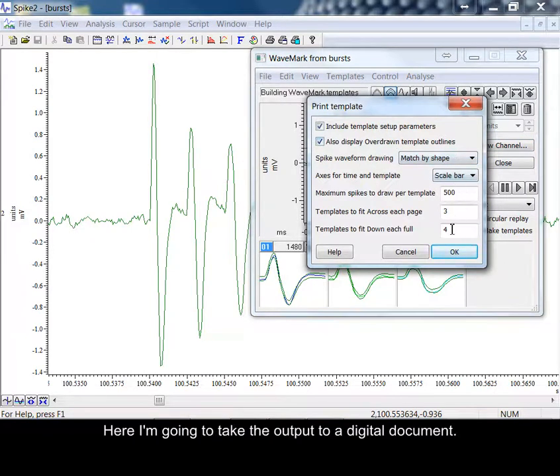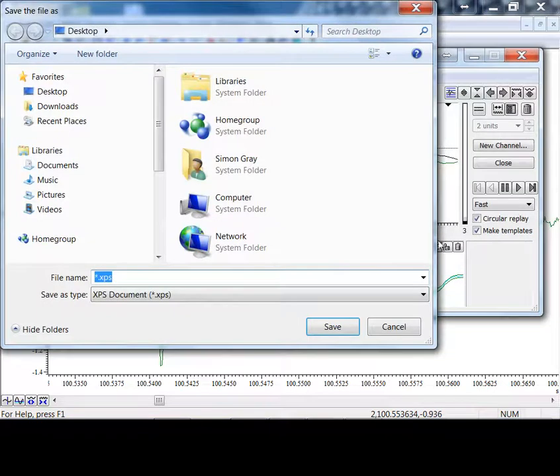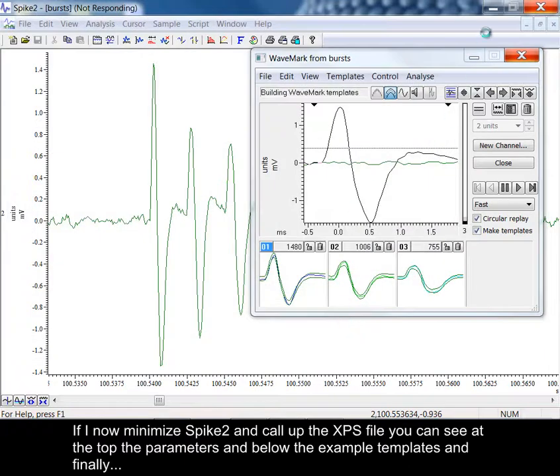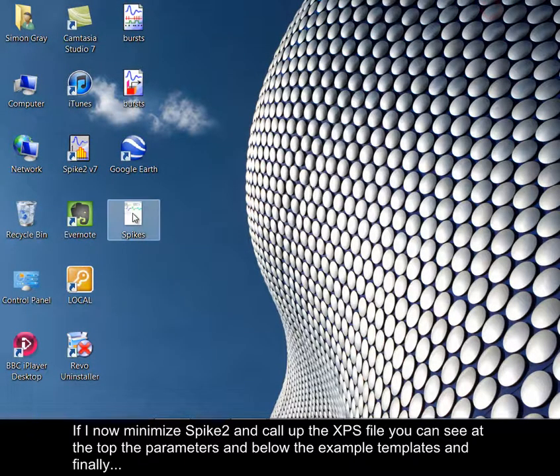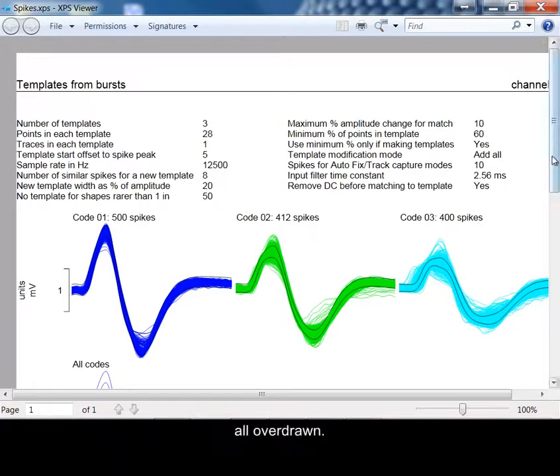Here I'm going to take the output to a digital document. If I now minimize Spike2 and call up the XPS file, you can see at the top the parameters and below the example templates and finally all overdrawn.